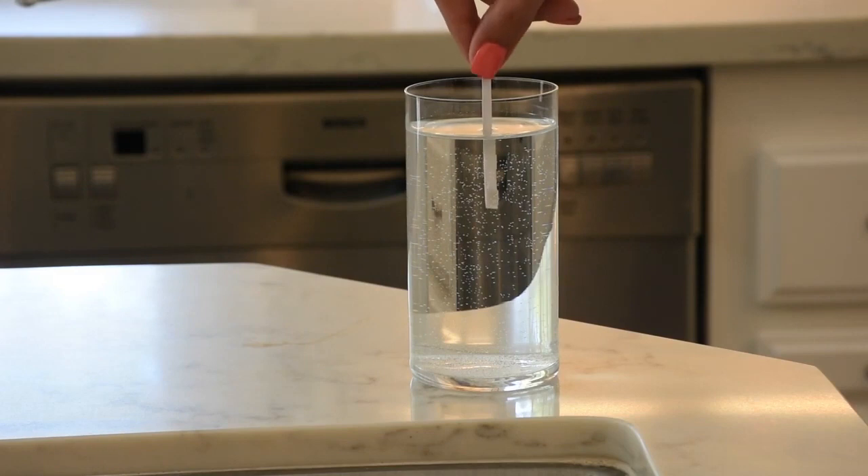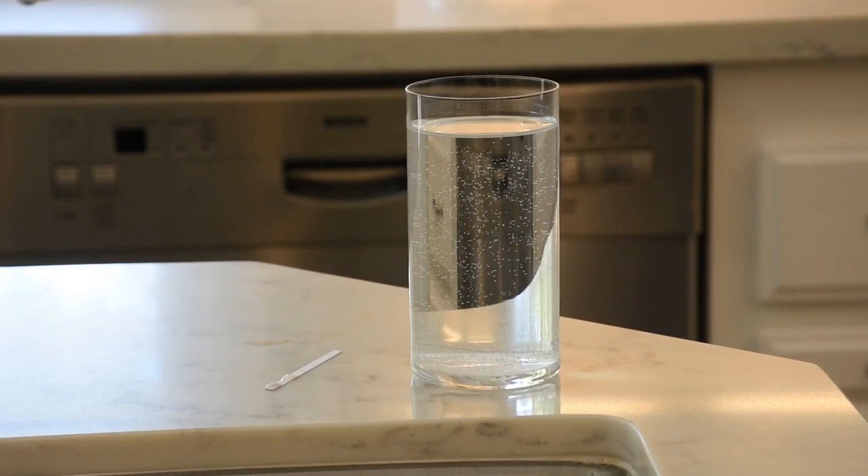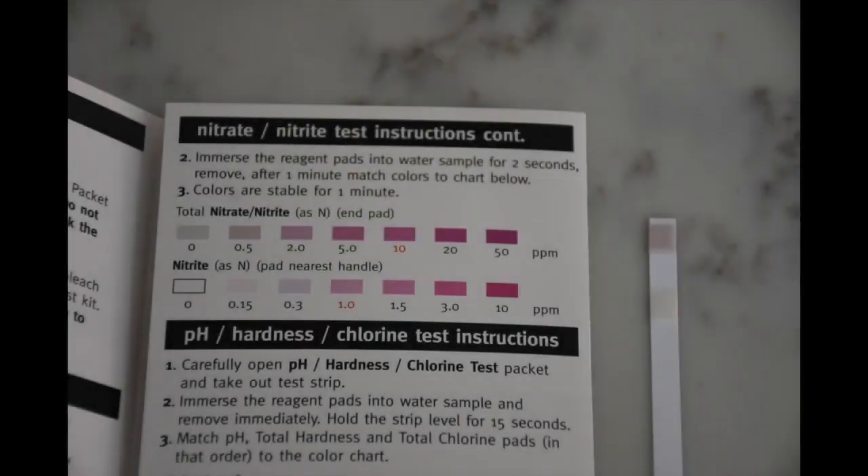Remove the strip and immerse the reagent pads into a water sample for two seconds, then remove. Place the strip down for one minute until the color becomes stable. Refer to the instruction leaflet to interpret the results.